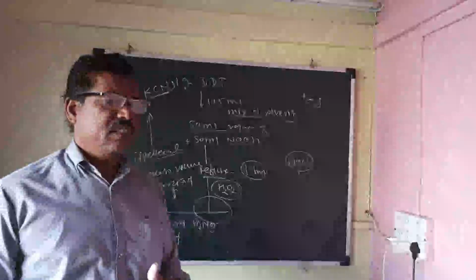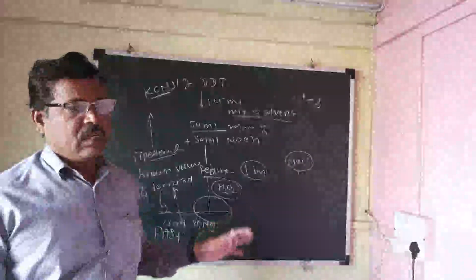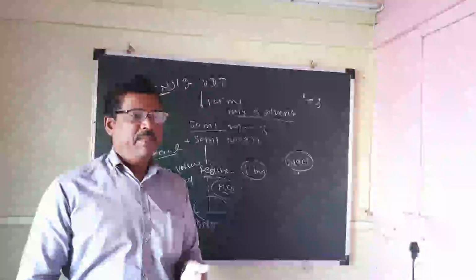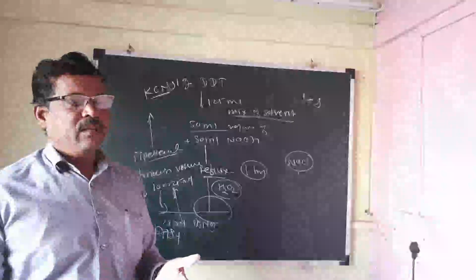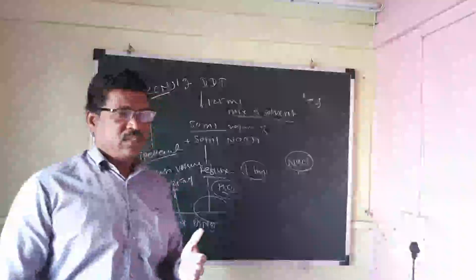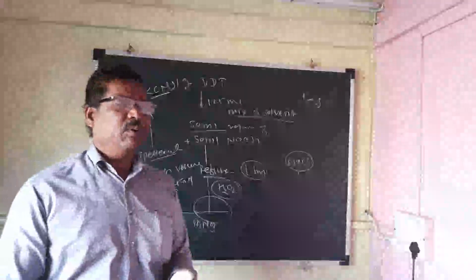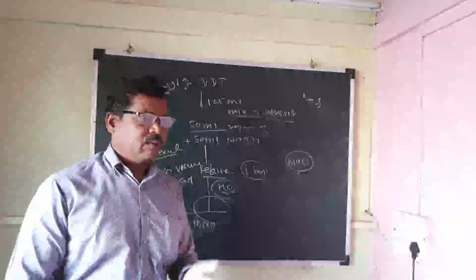Carry out the blank titration with the same 50 ml aliquot stock solution without hydrolysis. Add ferric alum, 2 to 3 drops of nitrobenzene, and silver nitrate, then titrate with potassium thiocyanate. This is the difference between the sample and blank readings. You can calculate the concentration or total amount of DDT from it.